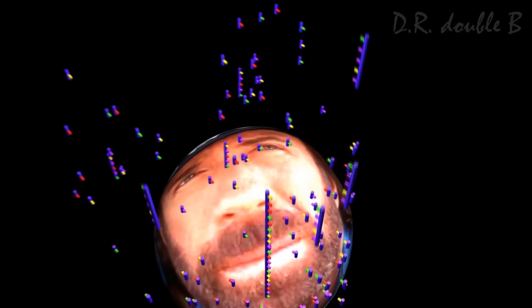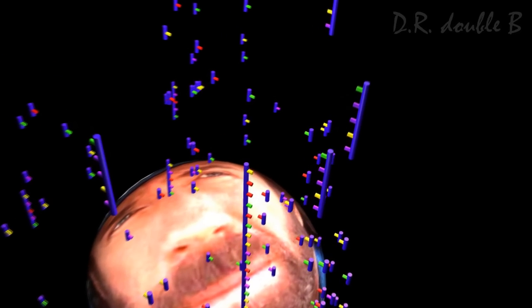I do not wish to favor one platform over another, so instead we will hybridize to Chuck Norris's beard. It is spherical, Chuck Norris, but still, sexy nonetheless.